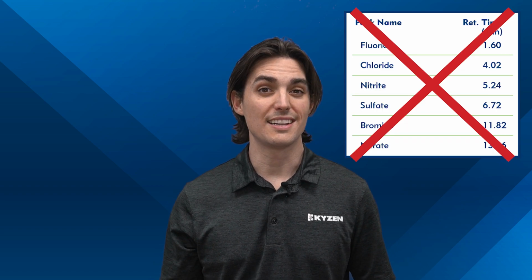In a previous episode, we spoke about how IC works and how we can use it to quantify cleanliness in our electronic products. When all our IC data falls below our upper limits, generally that means that everything about our process is in order. Now, on a slight side note, that's not always the case. You should always question your data, whether or not it's telling you the story you want to hear.